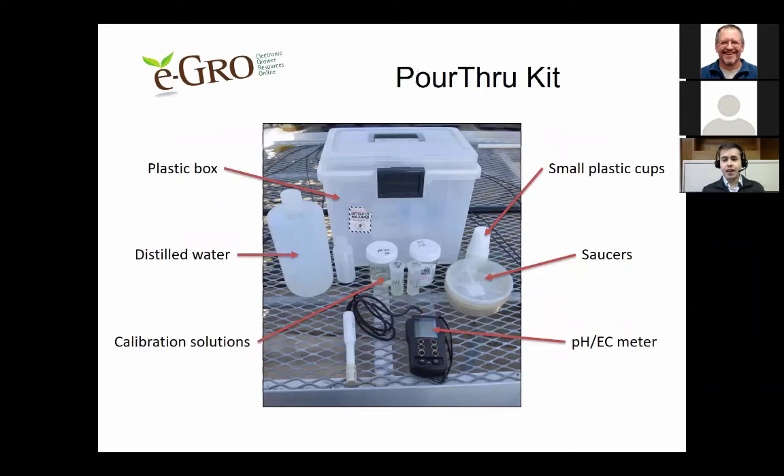Here you can see an example of a pour-through kit that we use. There's a large plastic box in the middle with a handle on top, which makes it very easy for transportation. There's a bottle of distilled water, calibration solutions in small jars or vials, small plastic cups, saucers, and of course a pH and EC meter, which is absolutely necessary for doing the pour-through method.